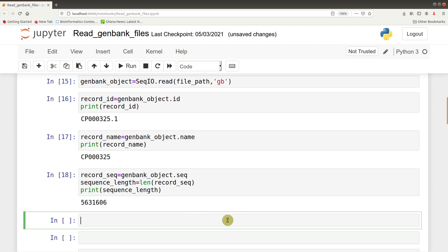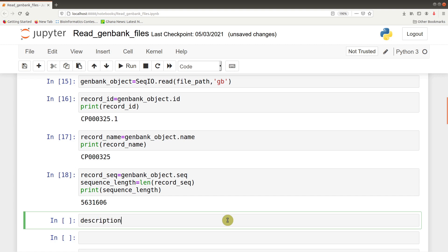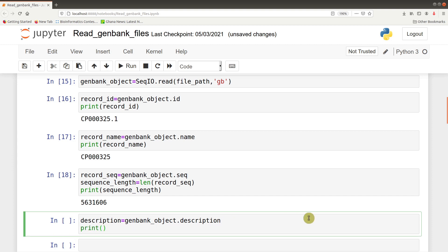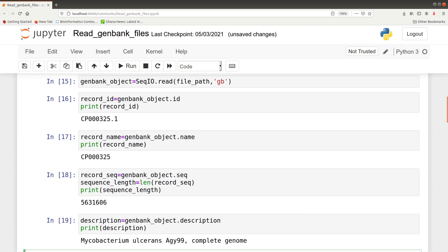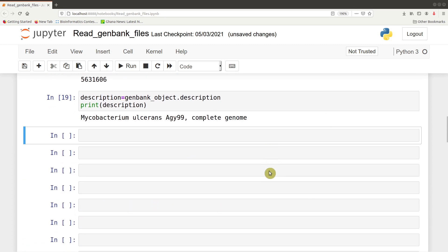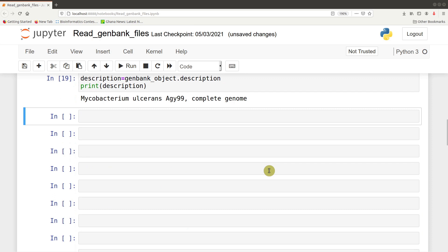Aside from that, you can also look at the description. So: description = genbank_object.description, then print(description). The description tells us it's a Mycobacterium ulcerans AGY99 complete genome.